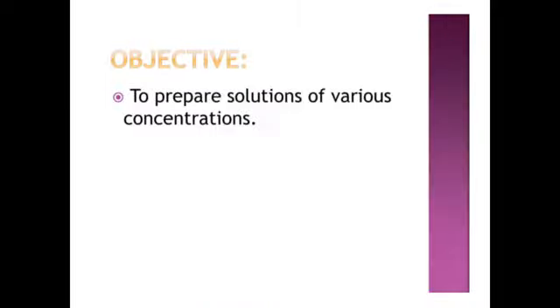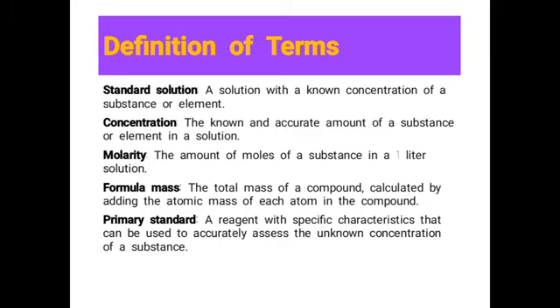Our major objective today is to prepare solutions of various concentration. Now let's look at some of the definition of terms. Number one is a standard solution. A standard solution is a solution with a known concentration of a substance or element.